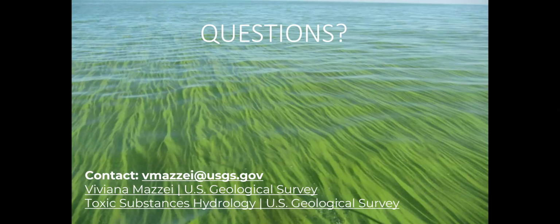Oh, okay. Yeah, so that's likely mitigating, because you saw how much nutrients we added in there, and that wasn't even enough to get it to bloom. Right. Okay. So we're thinking at those saturating levels, the ratio really is not going to have an effect, right? Sure. The light limitation is what matters. But we do provide the ratio data in the paper.